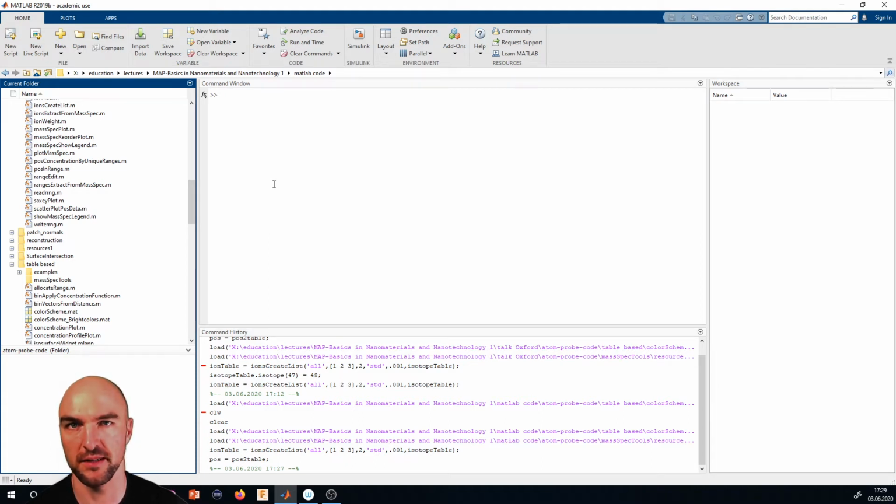For the first bit, you will get mostly data analysis tools, but in the next release, we'll also give you full reconstruction tools and even instrument calibration tools. So if you wish to build an instrument from scratch, we will also have that covered. Or if you want to do your own calibrations on your current instrument.